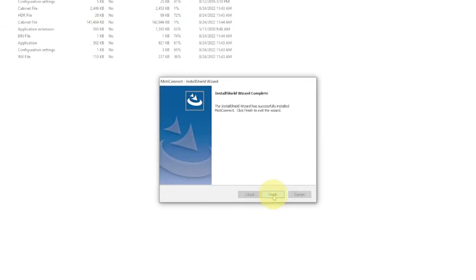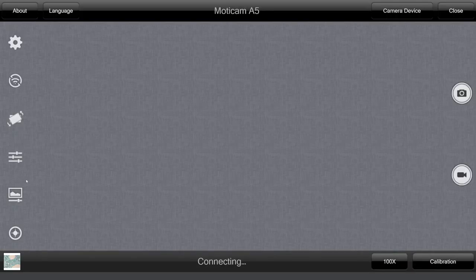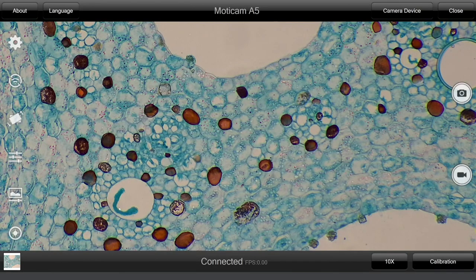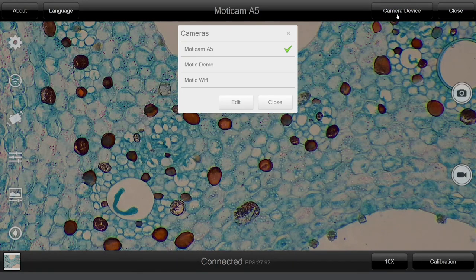Motoconnect is now ready for use. Click on the icon to open the program. Now let's quickly show you how the interface looks. First, make sure that your camera is attached to your microscope and connected to the computer. Both must be turned on for the image to appear on the screen. Your image will then be shown right away. If this is not the case, select the camera device button and choose your camera. Here we're using a Motocom A5.